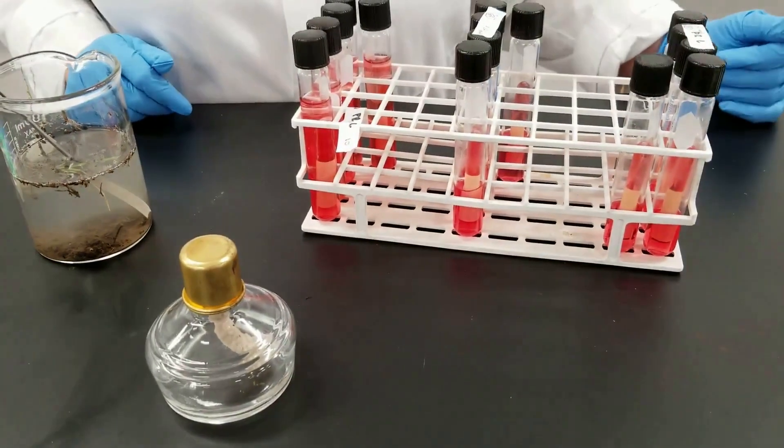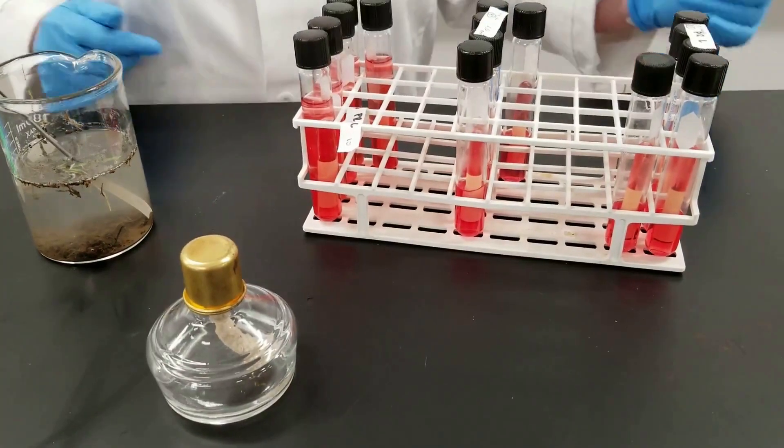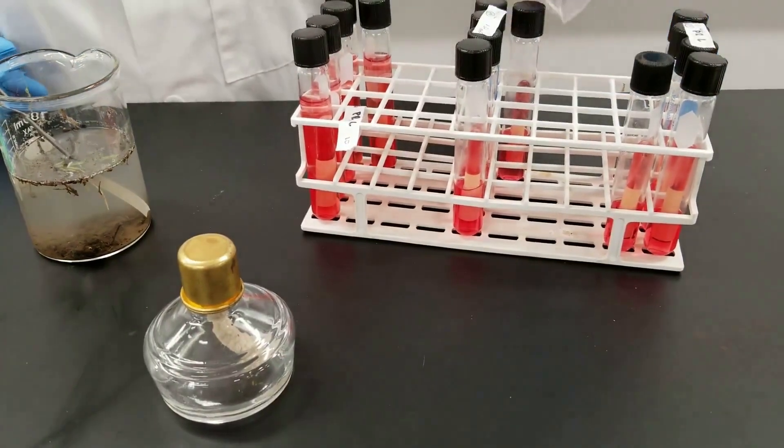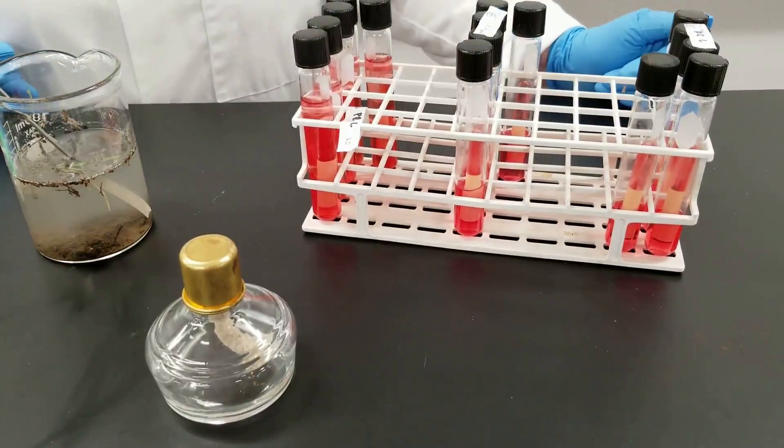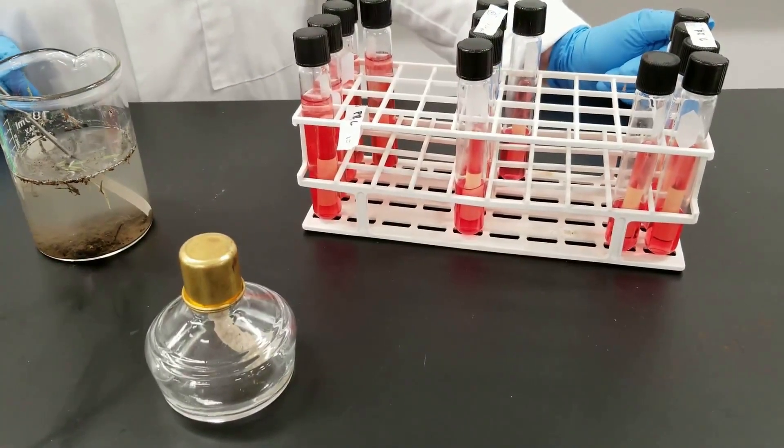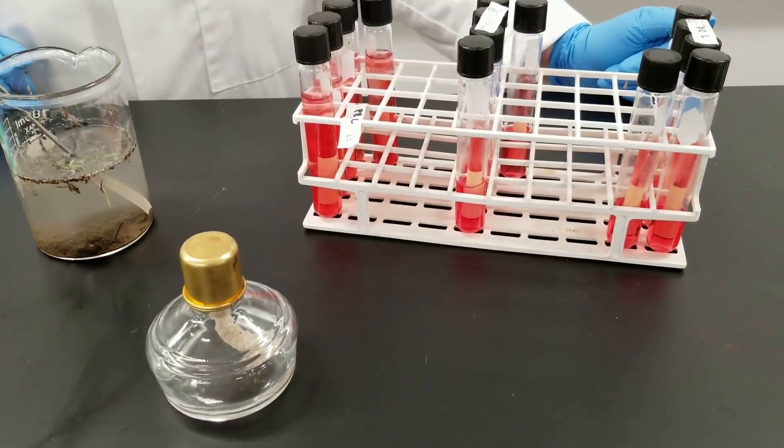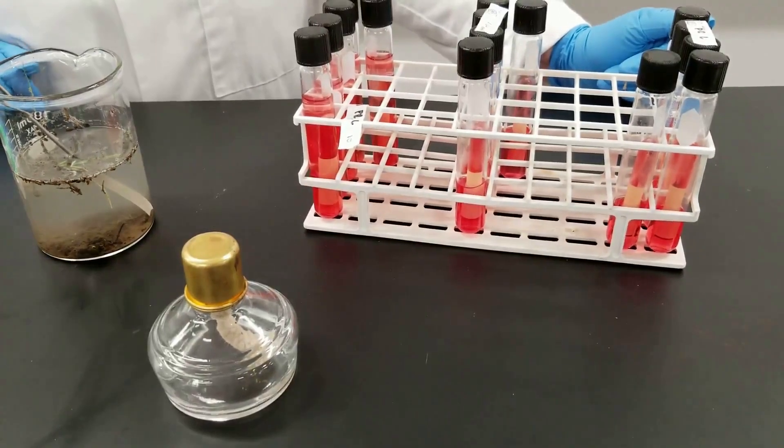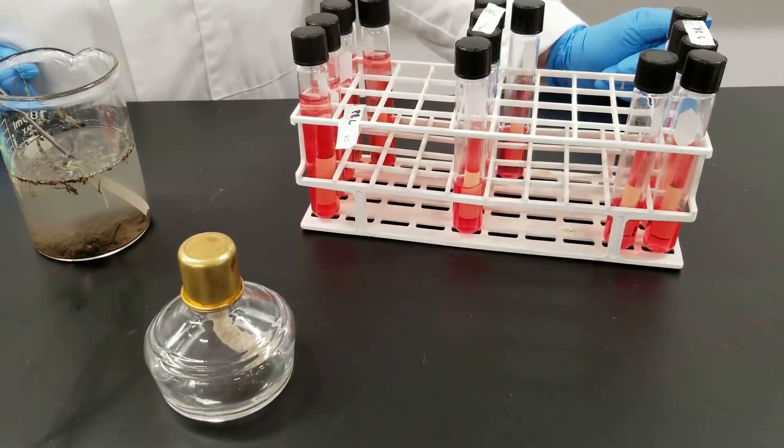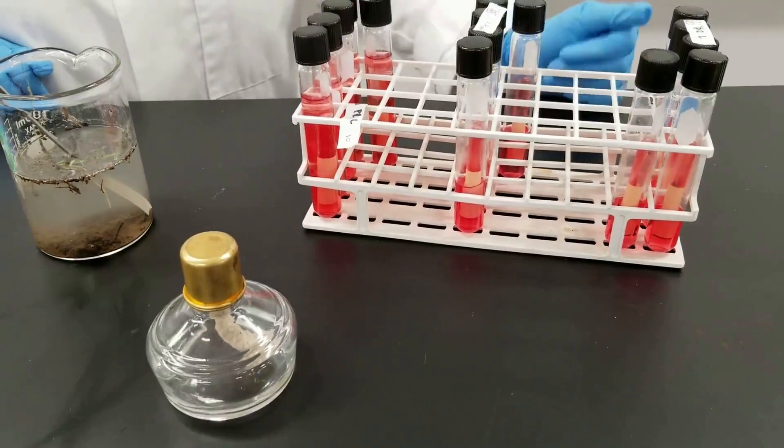We will see if gas is produced, has the phenol red pH indicator in it, so we can see if acid is produced, and we can compare at these three different dilutions. This will not give us an exact number, but it's an estimate of how many bacteria will be in the original sample of water.